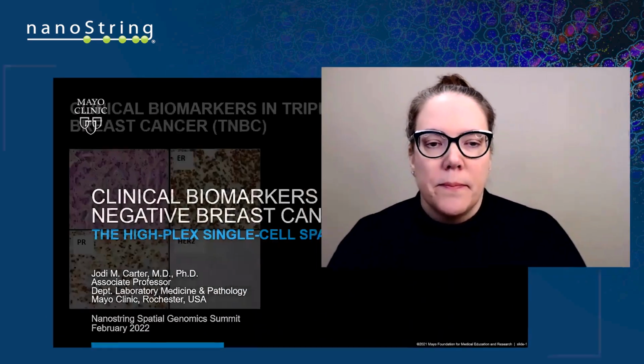Thanks very much for the invitation to share some of our work. We've been focused primarily on these novel and very exciting high-plex spatial platforms, specifically in the context of a direct translational application of clinically actionable biomarkers in triple-negative breast cancer.